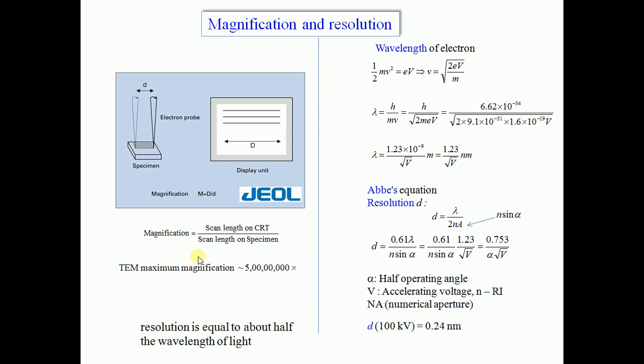No, it is a length. In order to find the resolution, we need to think of the important fact that electrons are supposed to behave as waves, because according to the de Broglie hypothesis, each particle exhibits a wave. If it is an electron, then the wavelength of the matter wave is lambda equals h by p, where p is mass into velocity, and velocity is taken from the kinetic energy: one half m v squared equals eV.